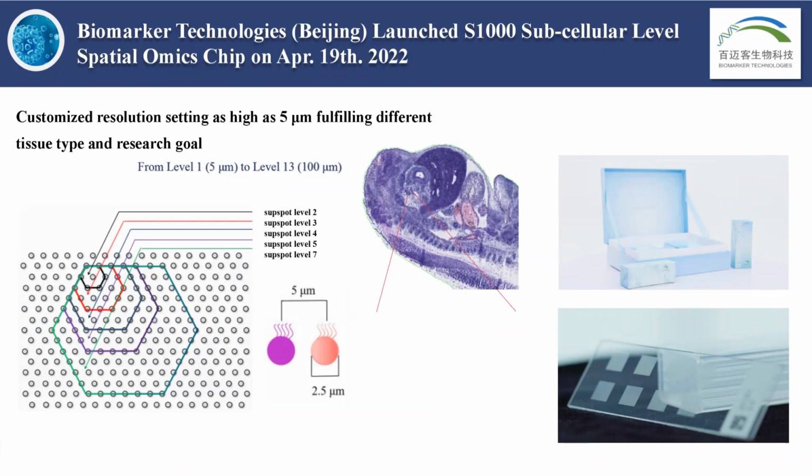So this technology really helps us to have more in-depth, more detailed information in the tissue sample, especially when we are looking at a very complex or very tiny structure alteration, etc.